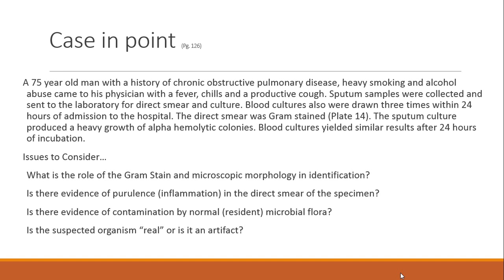They're in pairs. They're diplococci. Okay. Do you see anything unusual also kind of around them with this? A halo. What does that indicate? A capsule. Interesting. All right. Notice that they're almost kind of long bacilli, or long cocci. Almost like ants with no legs. Yeah. They're kind of stretchy cocci. Interesting. Okay.